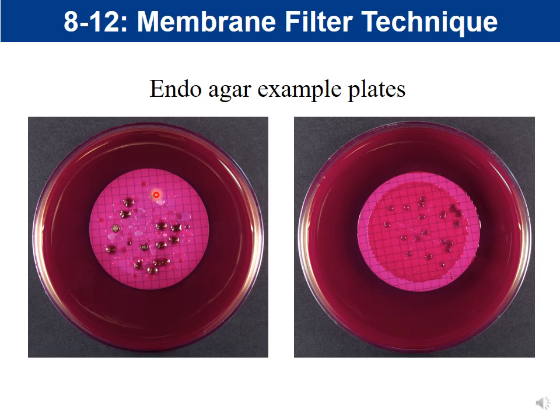And so oftentimes what happens when we do this experiment is that students will get colonies on their endo agar plate. They'll end up with some colonies. But when they do their LTB, they don't get any growth. And what that interpretation would tell us is that if you don't get any growth in the LTB, it's probably likely that any growth that's on your filter is carryover from somebody else's water sample. You can see this one here.